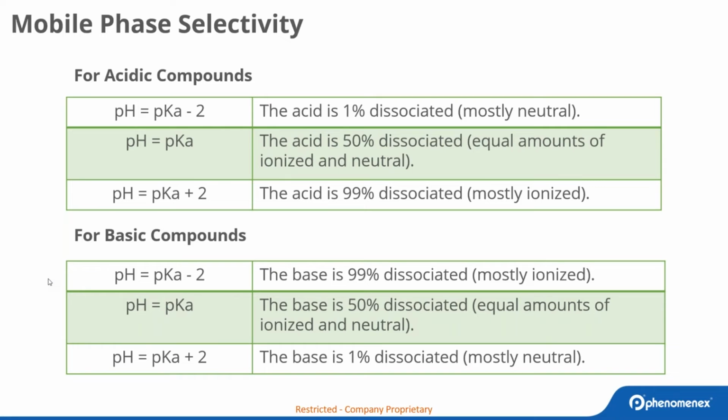Now, I understand you guys were saying that you struggle the most with stationary phase, but mobile phase selectivity does have a big impact as well on the retention of the analytes. So there are always challenges that come with analytes that are partially ionized polar compounds through reverse phase chromatography. When a molecule is ionized, it is more polar and therefore more likely to participate in hydrogen bonding. In reverse phase with aqueous mobile phase, the analyte will spend less time in hydrophobic interactions with the stationary phase and more time forming hydrogen bonds with the aqueous part of the mobile phase. That's compared to when that molecule is neutral. So it'll result in less retention of that polar analyte.